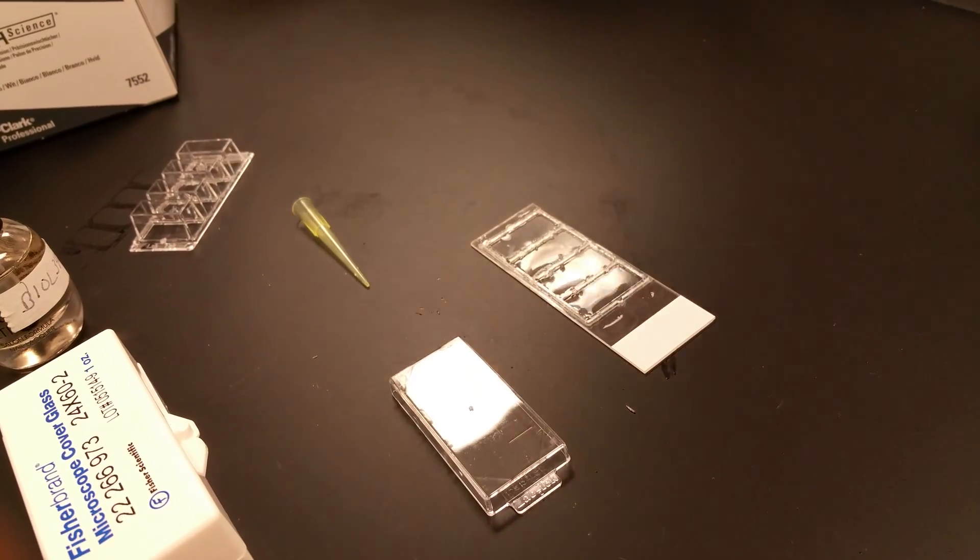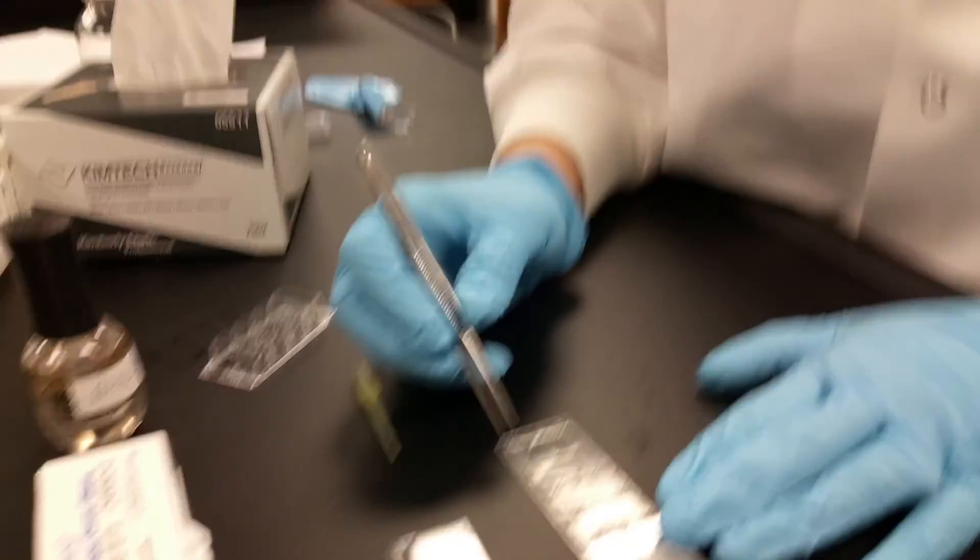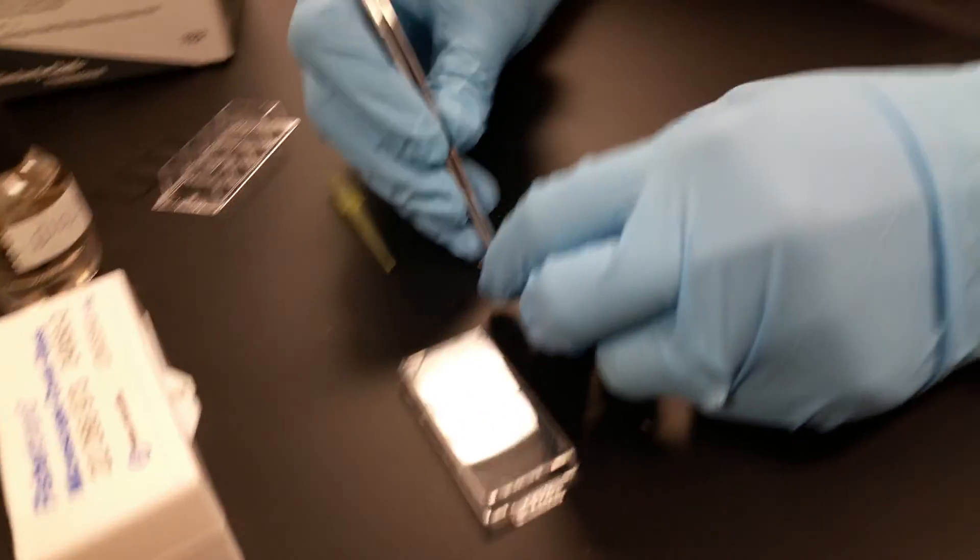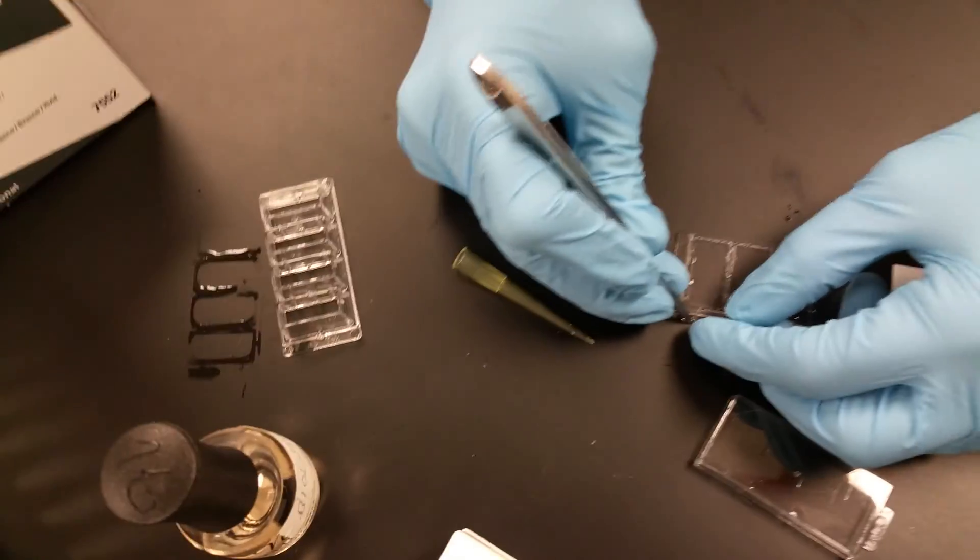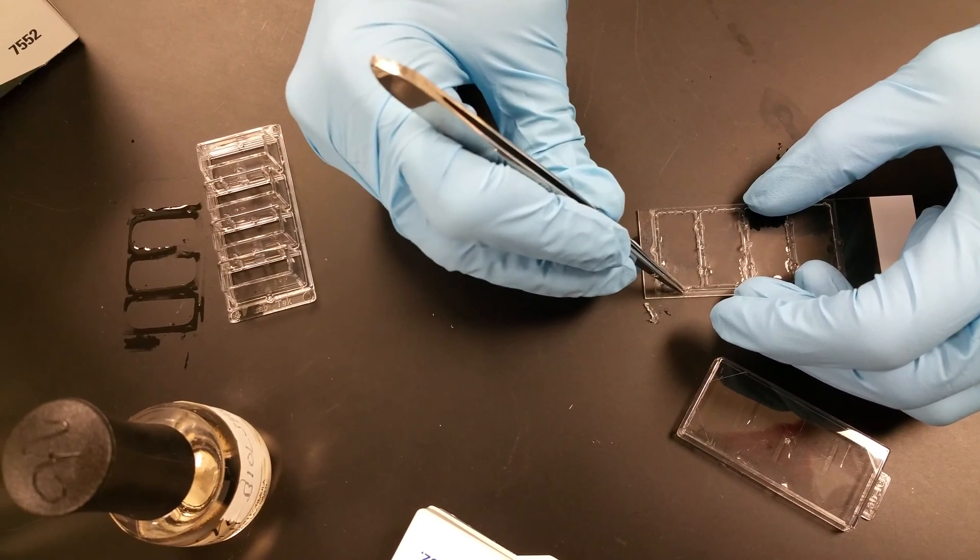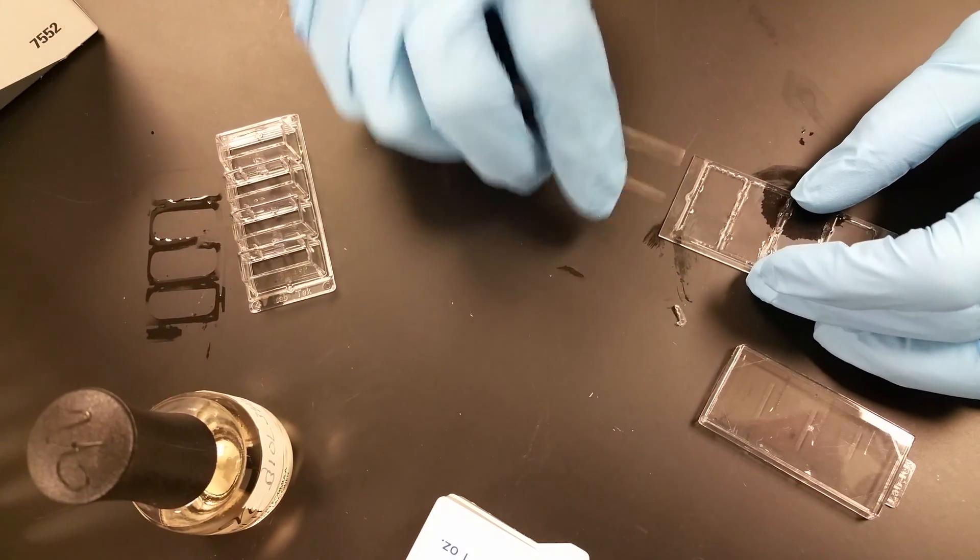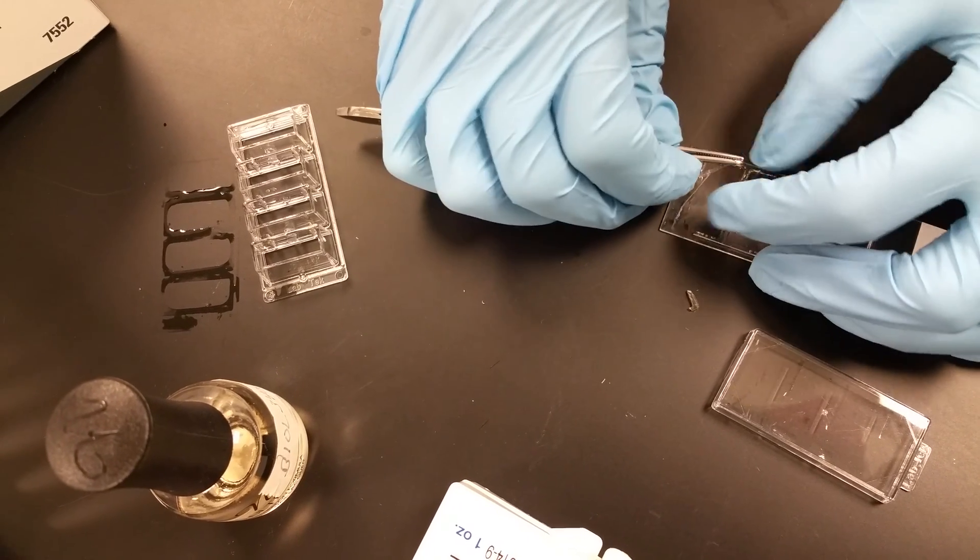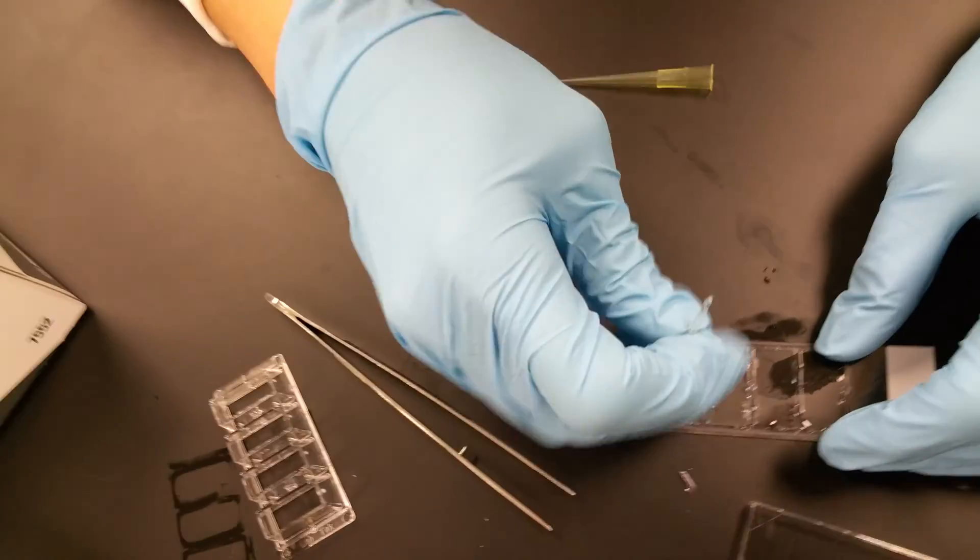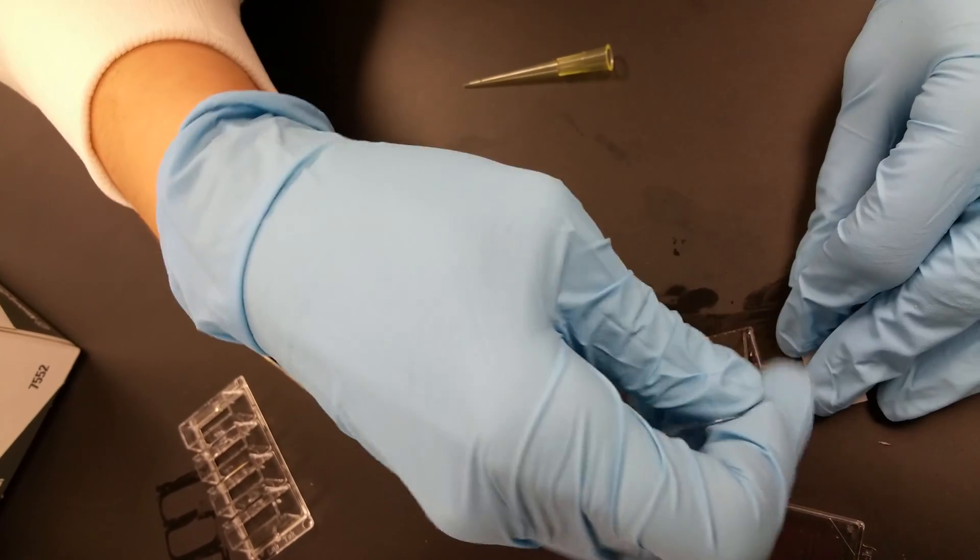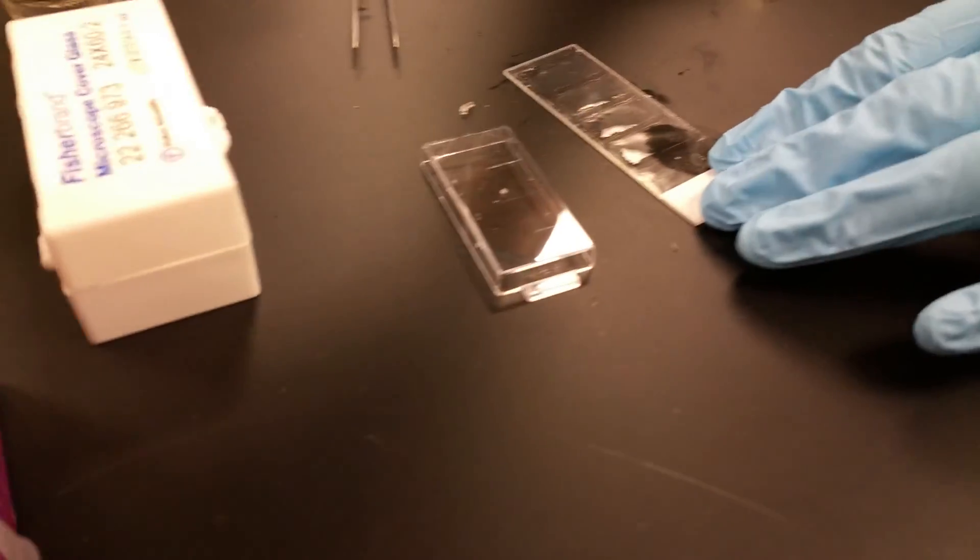With your tweezers, you can pull that off. Once you're able to pick up a piece of it, you can just peel this off the rest of the way. Now this part is gone.